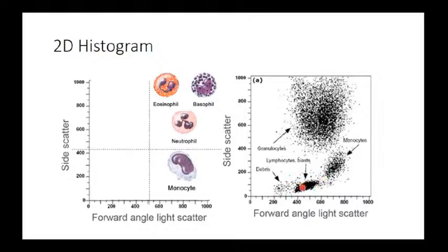Here we have very simple cells because they give very low signal on the side scatter, and they are smaller than monocytes and granulocytes. So obviously these are lymphocytes because lymphocytes are smaller in size and they are simple cells. Of course, this is a very useful technique used to count the cells and to analyze the phenotype and the health situation of the cells.